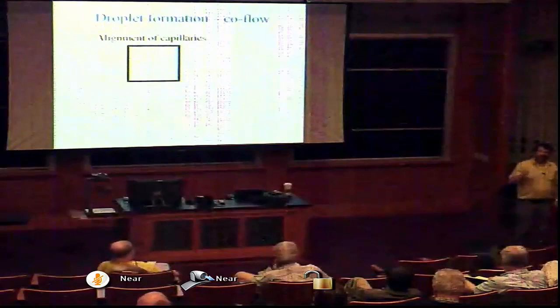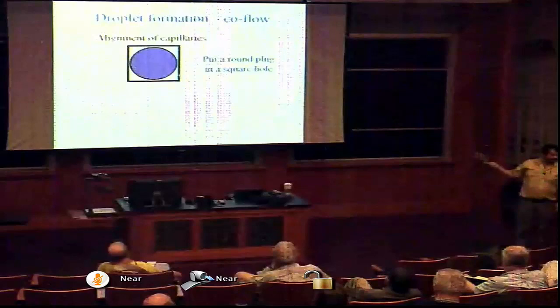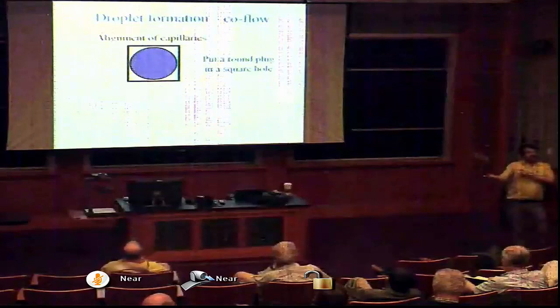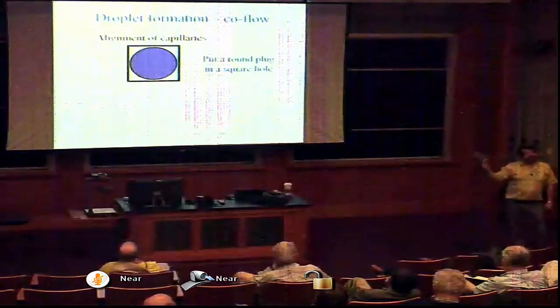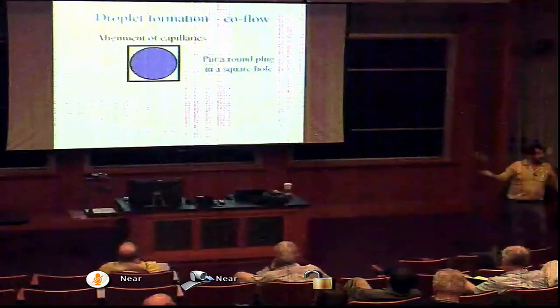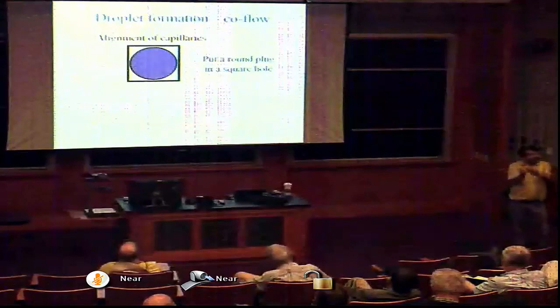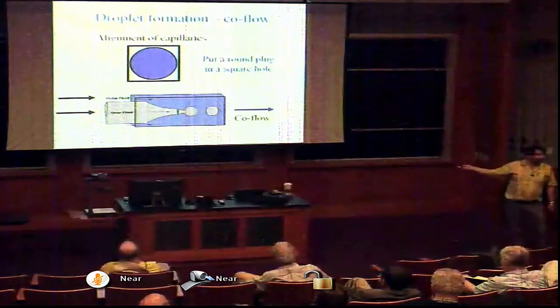But if you had a square where the inner dimension of the square exactly fit the outer diameter of the circle, it threads very nicely, and you can just butt it up against these two edges, and if it's a cylinder and a square, these align themselves perfectly. So you can take this cylindrical capillary tube, and you can buy square capillary tubes, and you can align these things really easily and really simply just by this. Then you can flow fluid through the middle here and through these four interstices. But remember, downstream of this middle, it's tapered to a very narrow orifice. So although the area looks very large here, it's actually very small. Now you can flow two fluids, one fluid into a second. The second fluid is flowing around it. And this turns out to be a very easy way to align these devices.